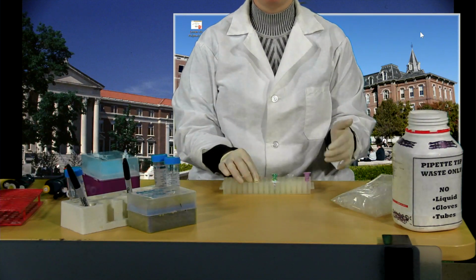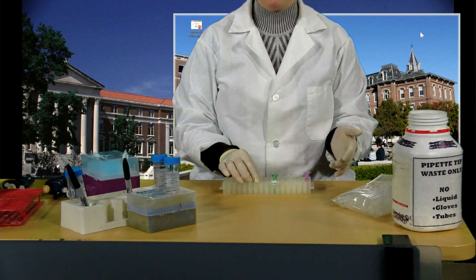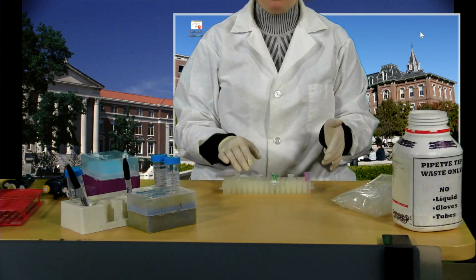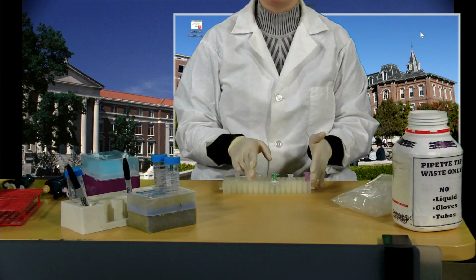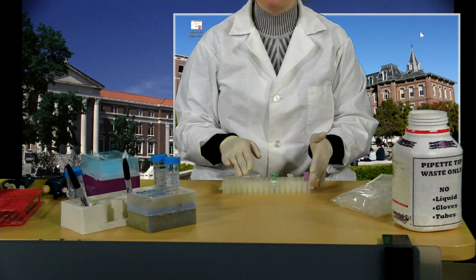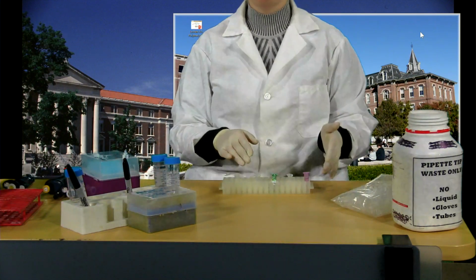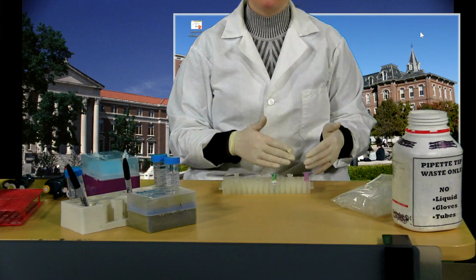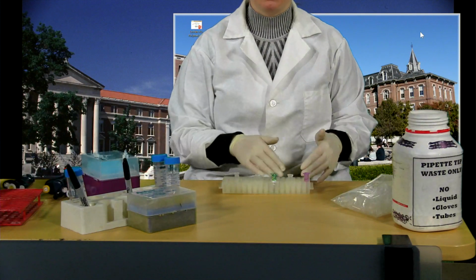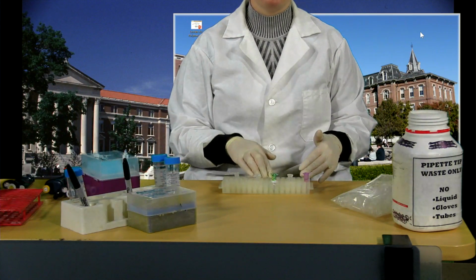But given that we're doing this for multiple minutes, for 5 minutes, and some of you may have done even longer assays over the last couple of weeks, the longer the time, the smaller the error is in terms of however long it took you to set those up. So you just need to think about it on a case-by-case basis, as how important is it that I'm really, really fast in setting up this particular assay or this particular test.